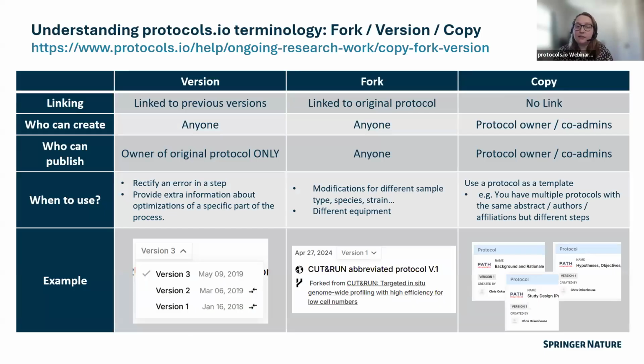As I mentioned, this is a more advanced workshop, so I'm not going to go into getting started on protocols.io, but I want to help with some of the terminology. We have three terms about protocols, which are version, fork, and copy.